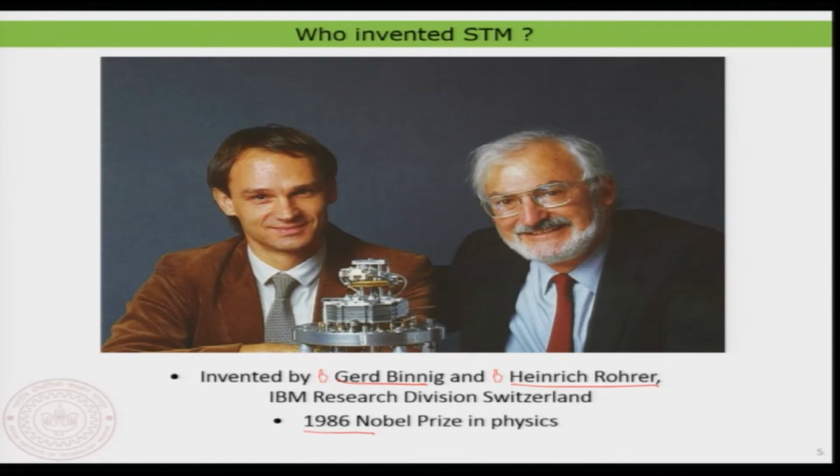Normally Nobel Prizes come after quite a lot of waiting, but this discovery was recognized immediately, after 5 years, because it is one of the most important discoveries where people could for the first time ever see atoms in real space. Some of the most unsettled questions were answered immediately, because seeing is believing. If you have a photograph, you believe that. So here you have images of the surface, so you will believe it. That's the most exciting part about it.